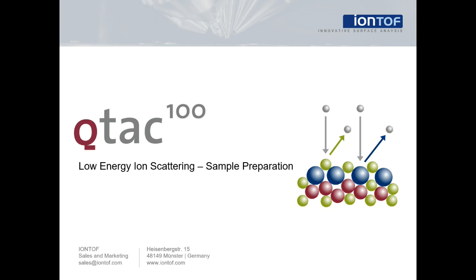Welcome to this short introductory presentation about low-energy ion scattering, often referred to as LEIS. In today's presentation we will discuss sample preparation.